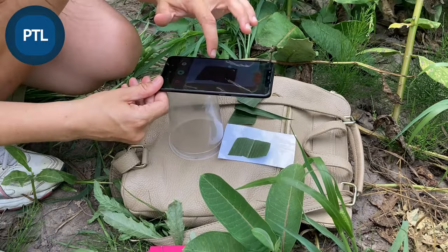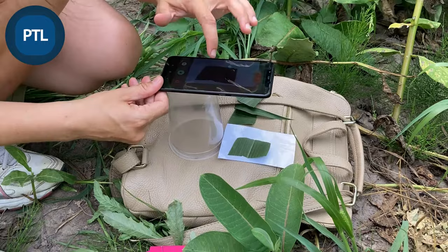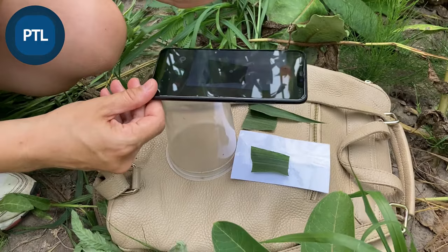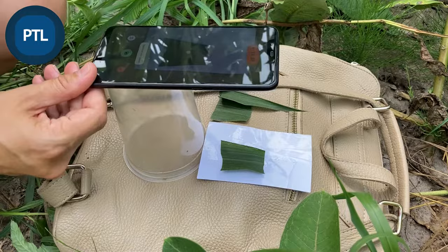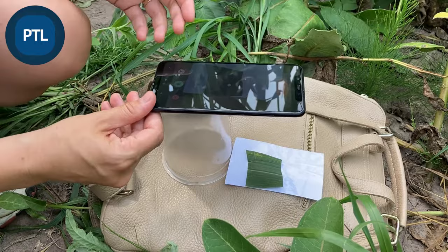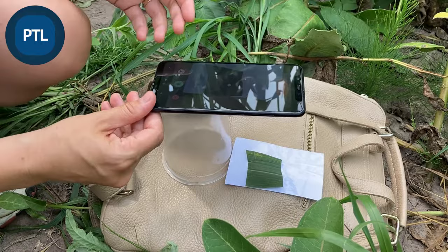This is the first piece — I save the measurement. This is the second piece — I save the measurement. This is the third piece — again, here we are. And the fourth one. We can continue like this until we finish measuring all the pieces of the leaf.